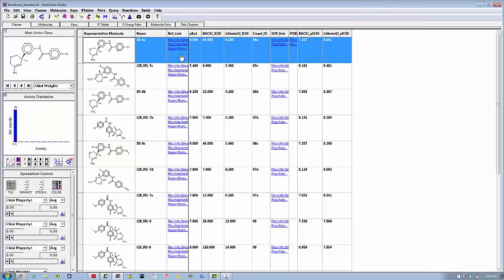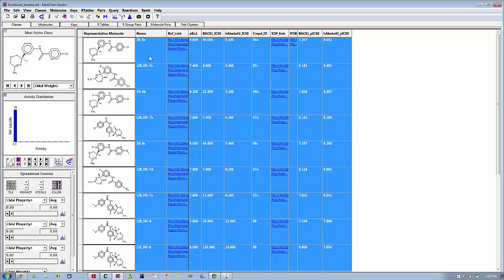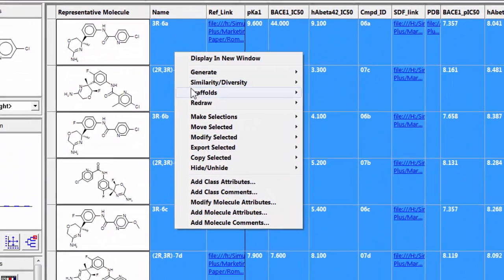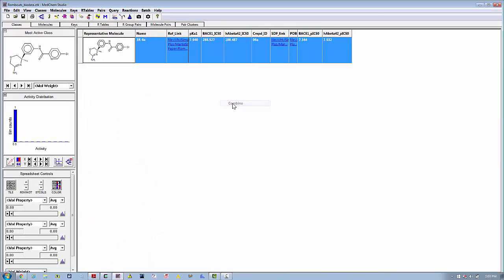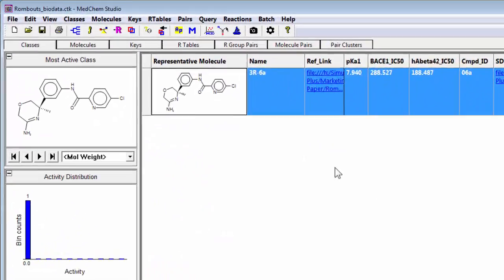We'll go back into MedChem Studio and the first thing we're going to do is select everything and put it into one class, so I'll combine the classes.